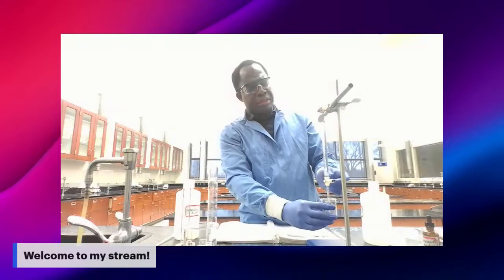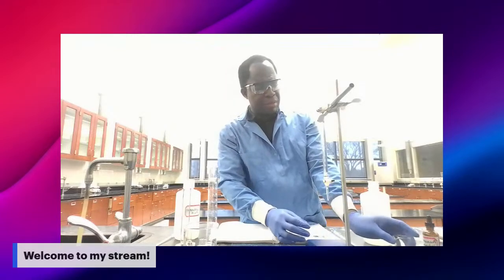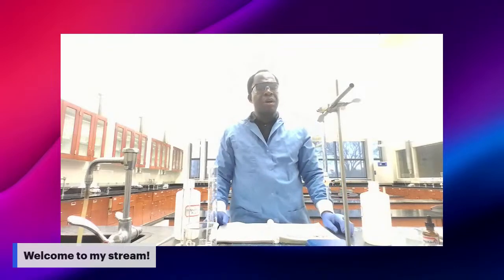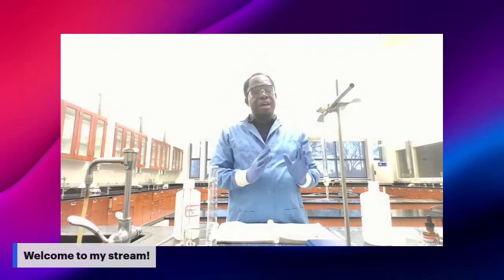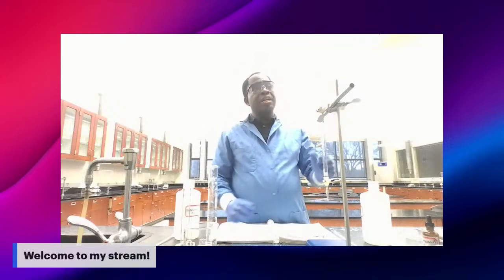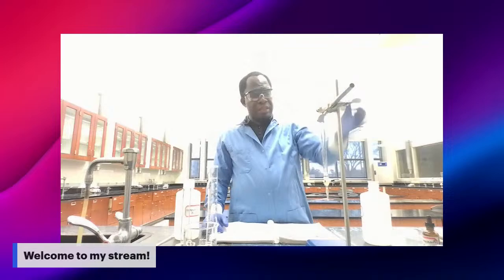I have a step I already performed before we start this video. You have to make sure you clean your burette. In order to do that, you fill it up with the same base, NaOH, and then drain it out. Fill it to the top and drain it out.